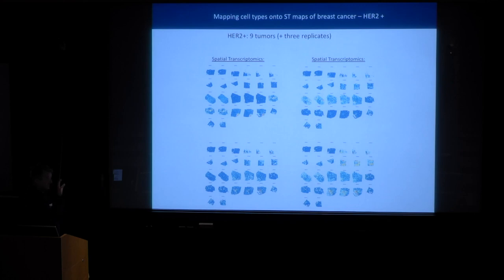So we could then do our ST experiments, and this is from some tumors. These are HER2 breast cancer tumors. I'm not focusing on any details here. These are triplicates of a number of patients and their tumors. We generate the ST data, but then we could link into the single-cell data sets that have described how adipocytes look at the gene expression level, or the CD8 cells, or the macrophages. So we could actually find, by combining these two, where the different cells are.